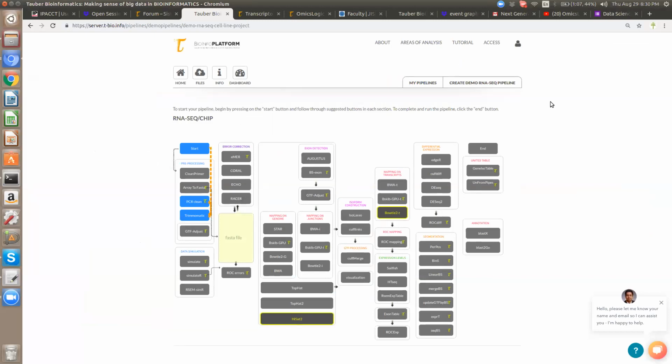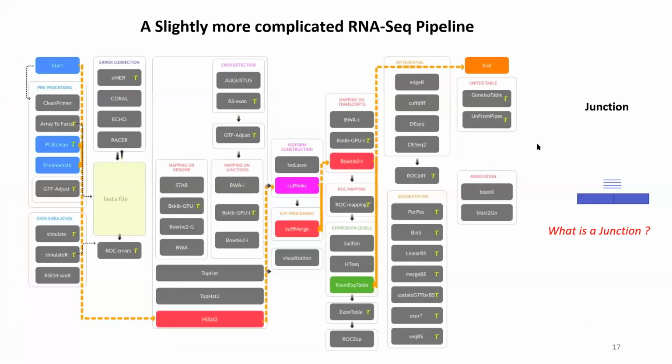Hello, Velu here. Velu, yeah, please. In this case, junctions would mean that we are looking at exons, which are transcripts coming out. We are looking at RNA-seq, so transcripts are coming out from the genome. So it won't actually be differentiating between different exons because they're all spliced together. Right. So when we look at the read, it could come out at the junction of exons. In this case, our read could actually be split into two places, and where it splits, the algorithm has to figure out. Exactly. You correctly pointed out the definition. Yes, please go on.